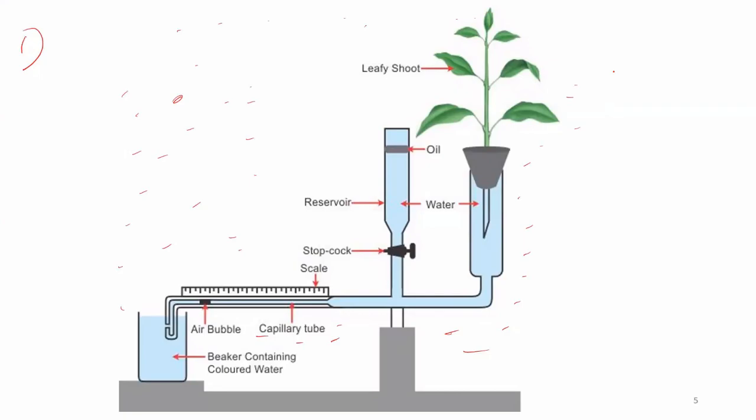That's why. So the setup should be in the submerged condition, to avoid air bubbles in it. Understood? Am I correct? Okay, ma'am.